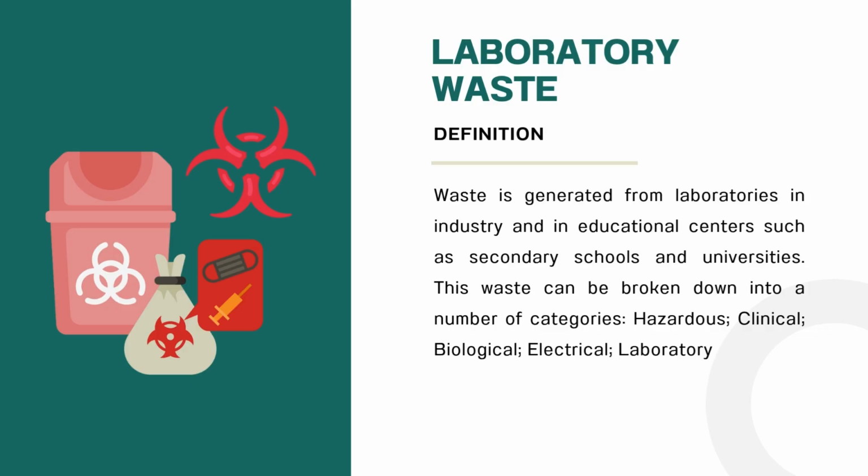Laboratory waste is created during scientific experiments in schools, universities, and industrial labs. This waste can include hazardous chemicals, biological materials, contaminated tools, or even damaged electrical equipment. Because each type has its own risks, proper sorting helps us dispose of it correctly and safely.